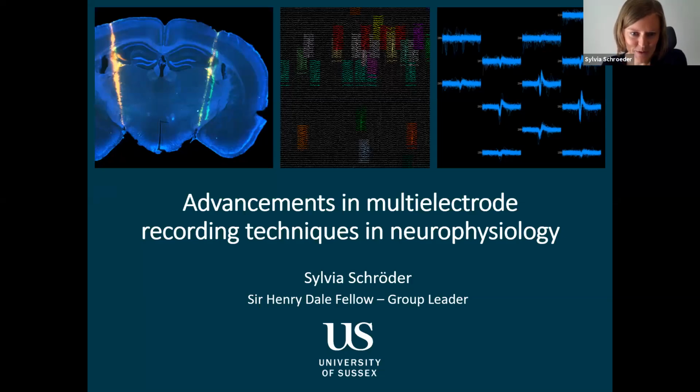So yeah, I'm a group leader at University of Sussex. I have used Neuropixels previously in my postdoc and will be using it in my group now. And my goal today is to tell you a bit more about the technology of Neuropixels and its advantages, some tricks in using Neuropixels, what kind of data you can get with it. But I think most importantly, I want to show you what kind of resources are available. So Chris already mentioned there is a lot of resources there. And my goal is to make you a bit more aware of those and the community out there.